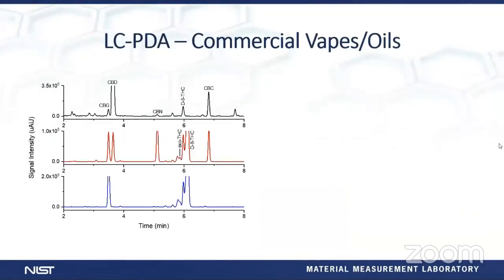So in general, that kind of wraps up that aspect of when we wanted to do similar to what we did with plants and look at some commercial samples. I'm just showing you a few chromatograms here of 3 samples that we obtained here in our lab that we are measuring. There at the top is a very general hemp sample, where you have a fairly clean chromatogram. You'll have a delta-9 THC by itself, but we also included some delta-8 THC products in this case, because we wanted to see how that would affect the analysis that we've done.